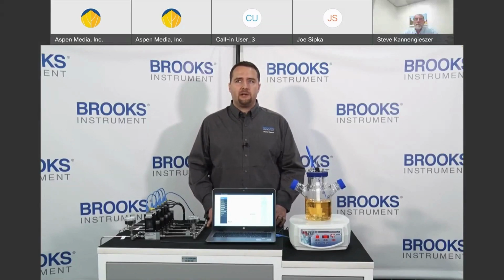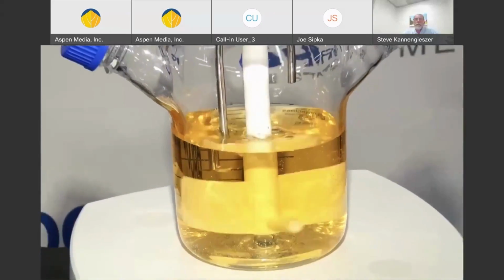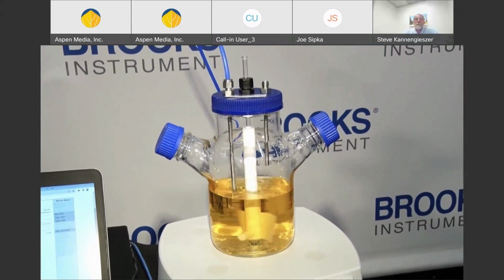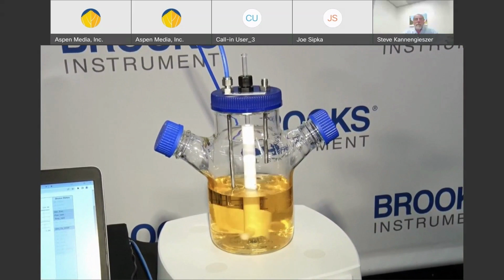Backstream is a gas or liquid backflowing through the MFC. To put it another way, it's flow that is reversed from the normal flow direction. In a biotech application, this backstream condition can result in process downtime and costly repairs if fluid or other process material backflows into a precision device such as a thermal mass flow controller or meter. Avoiding this situation in the first place is key to preventing costly damage.